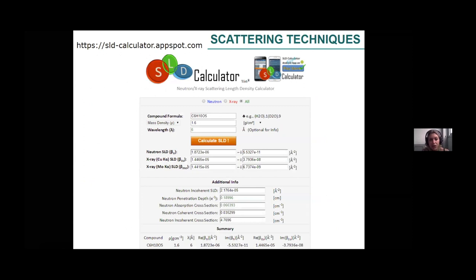Here is an example of an online calculator that I use often to calculate the scattering length density. Here is the example for cellulose — you only need to input the molecular formula of the material and the density, and then you can calculate the neutron and X-ray scattering length density.